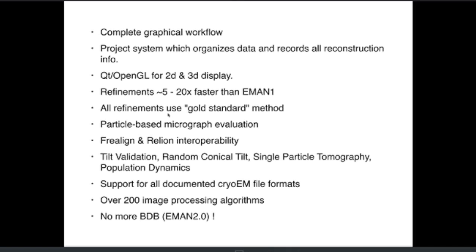And that meant that resolution wasn't really a very robustly defined phenomenon. So both Eman and RELION now use this gold standard method, and you can use the same method in other available software packages as well, even though it may not be quite as integrated. It's not a solution to all of the validation problems in the field, obviously, but it is a solution to at least a couple of problems in the field.